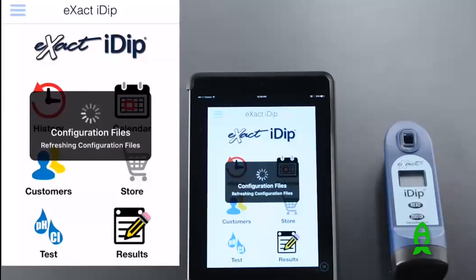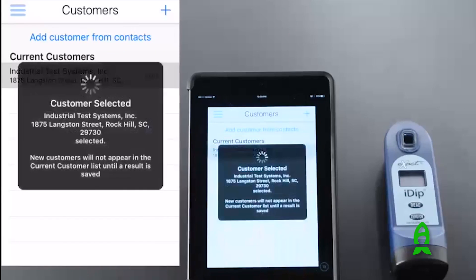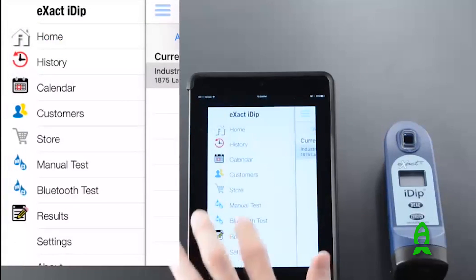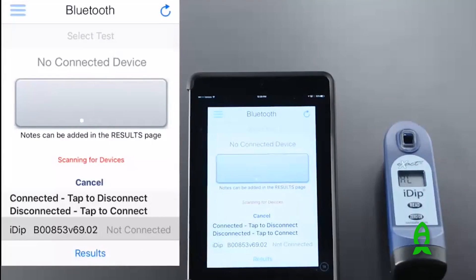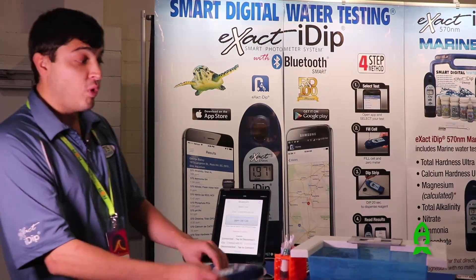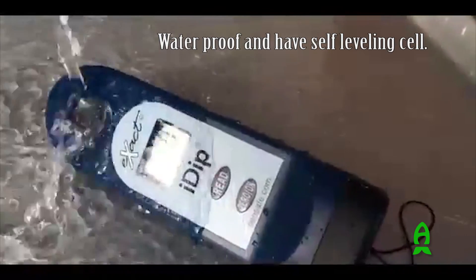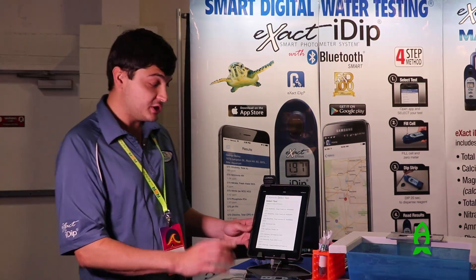The photometer works as a Bluetooth smart device. It can hook up to an iPad, an iPhone, Android tablets, and Android phones. It's very simple to use — you just download the app and connect via Bluetooth. You can see it automatically connects once your photometer is on. You will take a sample of your water from your tank. It's waterproof and has a self-leveling cell. Once you have your water, you'll go into the app and select what test you want to do.